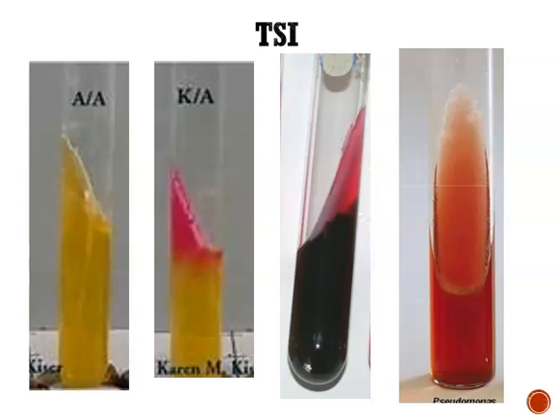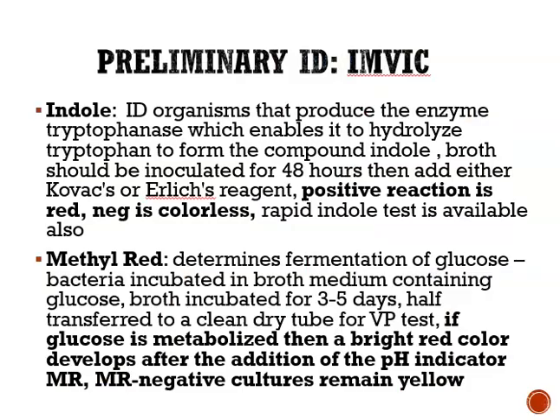So this tube, it could be one of two things. Either this tube has not been inoculated, or it could just be that it has not utilized any of the sugars. It's not produced gas. It's not produced hydrogen sulfide. But it says here on the bottom, I can see where it says Pseudomonas. So this one has been inoculated, but it's with an organism that is not in the group of Enterobacteriaceae. This organism is one that is in a larger group known as non-fermenters. So this makes sense that it has not utilized the sugars.